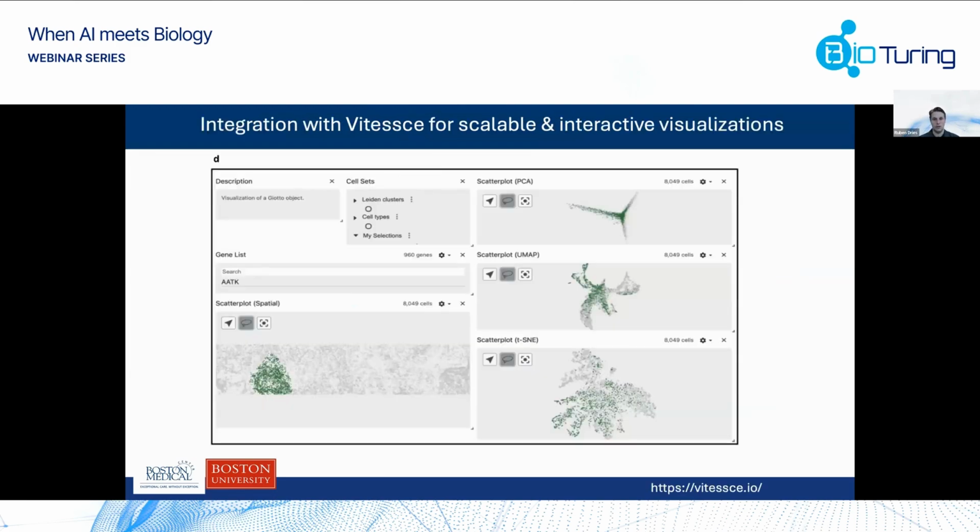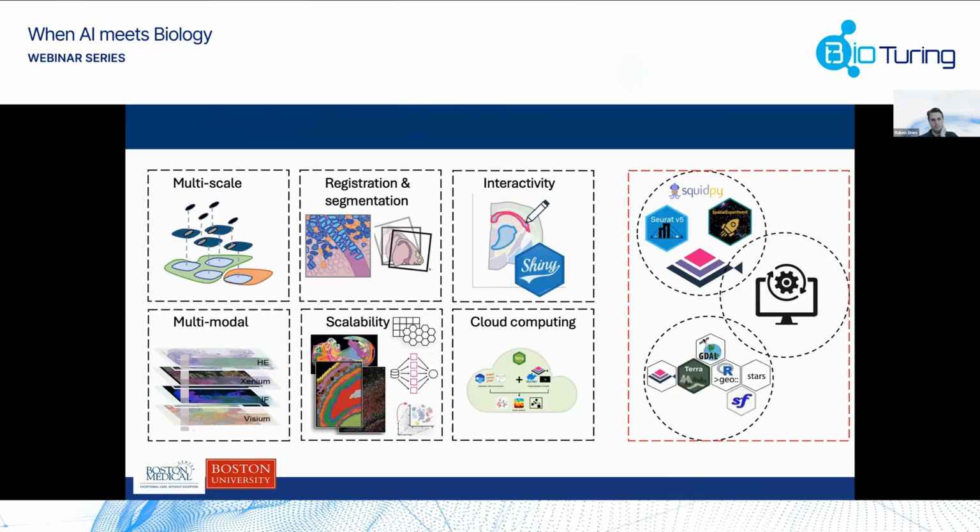And finally, we can also connect directly with Vitessce, which is a visualization framework from the Gehlenborg lab, also here at Harvard, which makes scalable interactive visualization a little bit easier. So right now you do have to go back and forth, so it's not automatically updated.